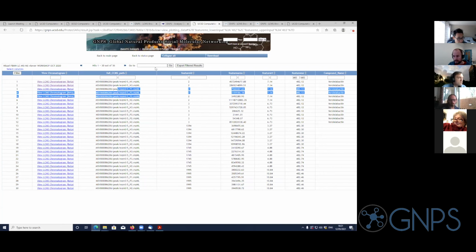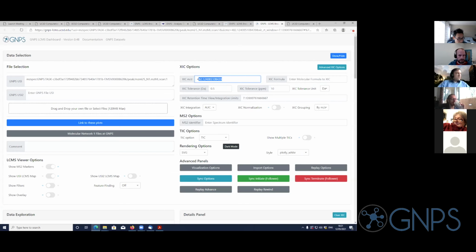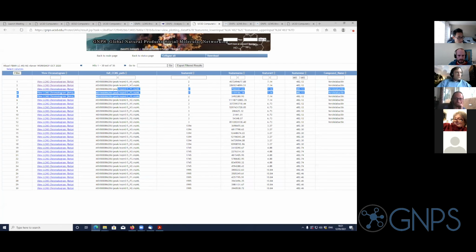You can also do quick comparisons between two groups when you use the GNPS USI1 and USI2. And what you need is just those strings. I can simply copy them and then provide the names from the mzML files. In this case, it would be S underscore N1, N2, N3, and S underscore P1, P2, P3.